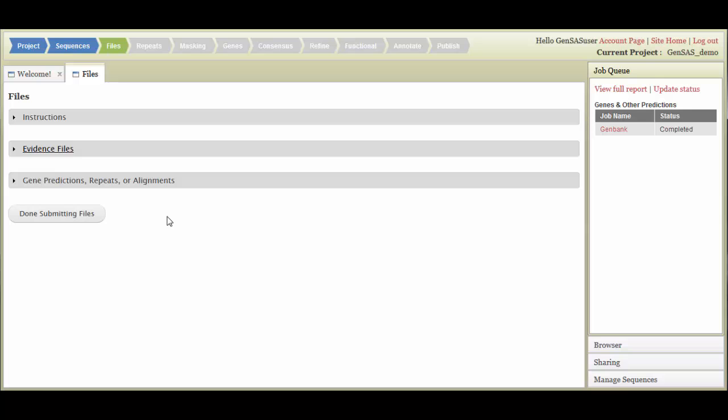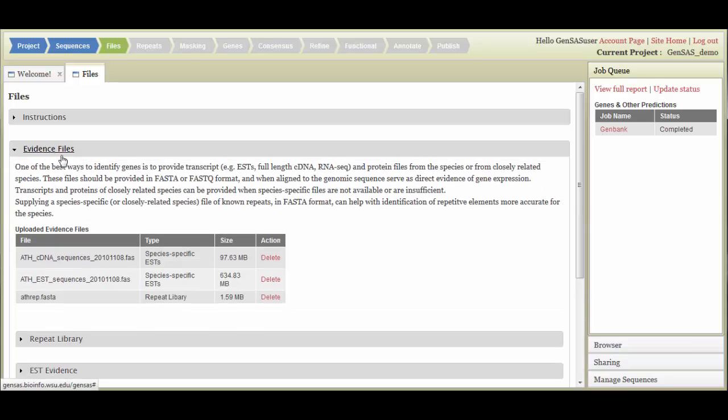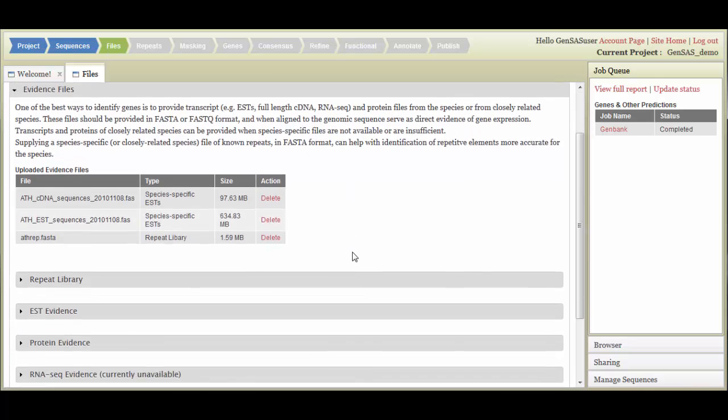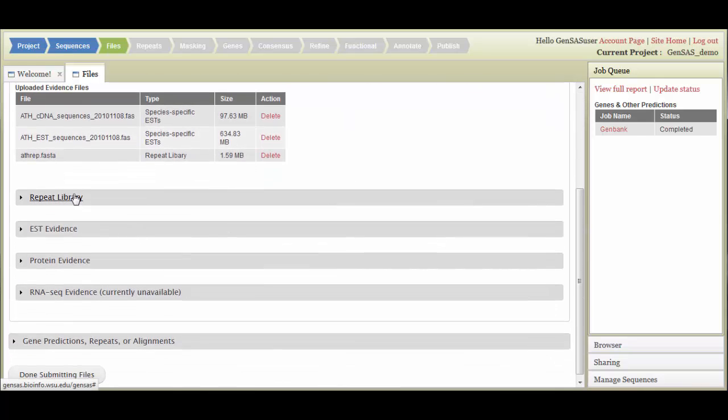There are a few different file types that can be added to GenSaaS. Under the Evidence Files section, you can upload FASTA files of repeat libraries, cDNA, EST, and transcript evidence, or protein evidence.